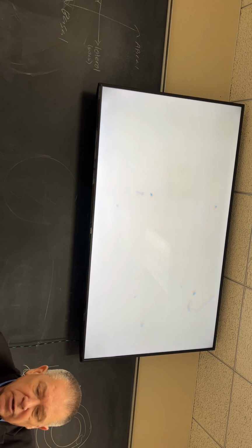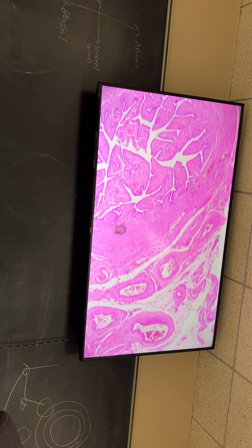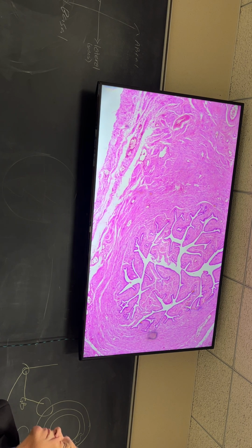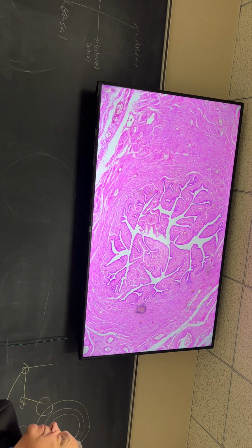All right, I'm gonna have to dig for this one. Because I don't know if we have any, oh, there's one, hold on. I saw one right there. Found one, okay. There we go, not bad. Somewhat like your picture, right? Different stain, but same structure, right?